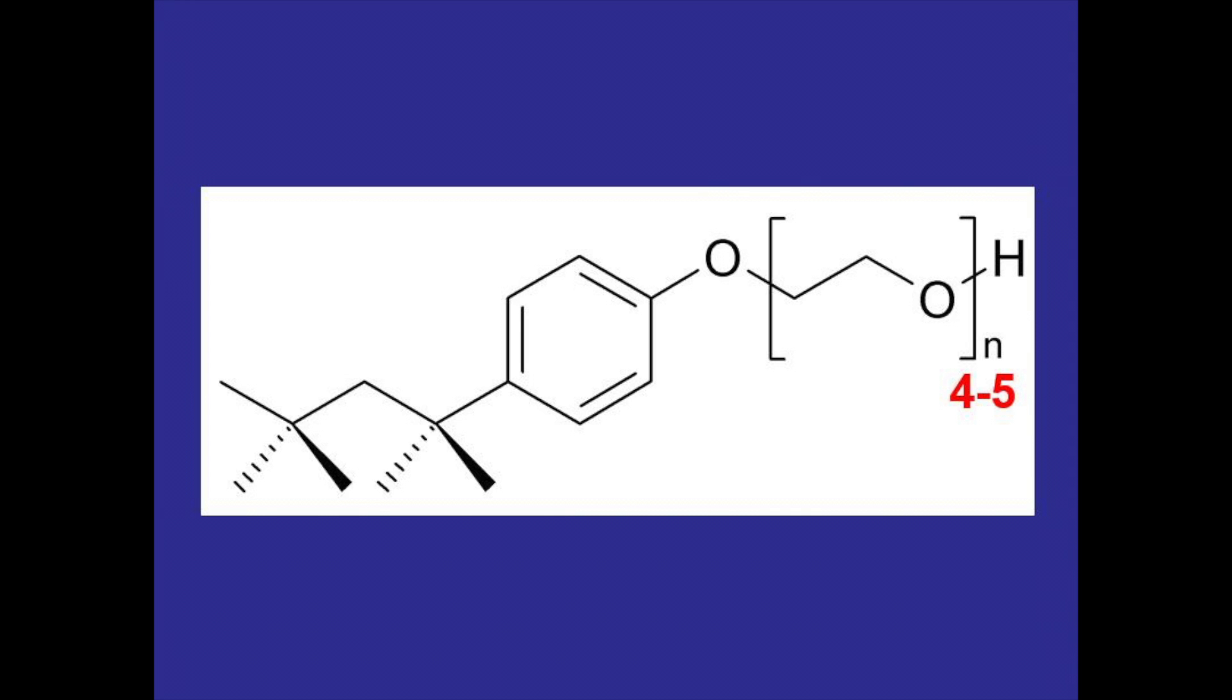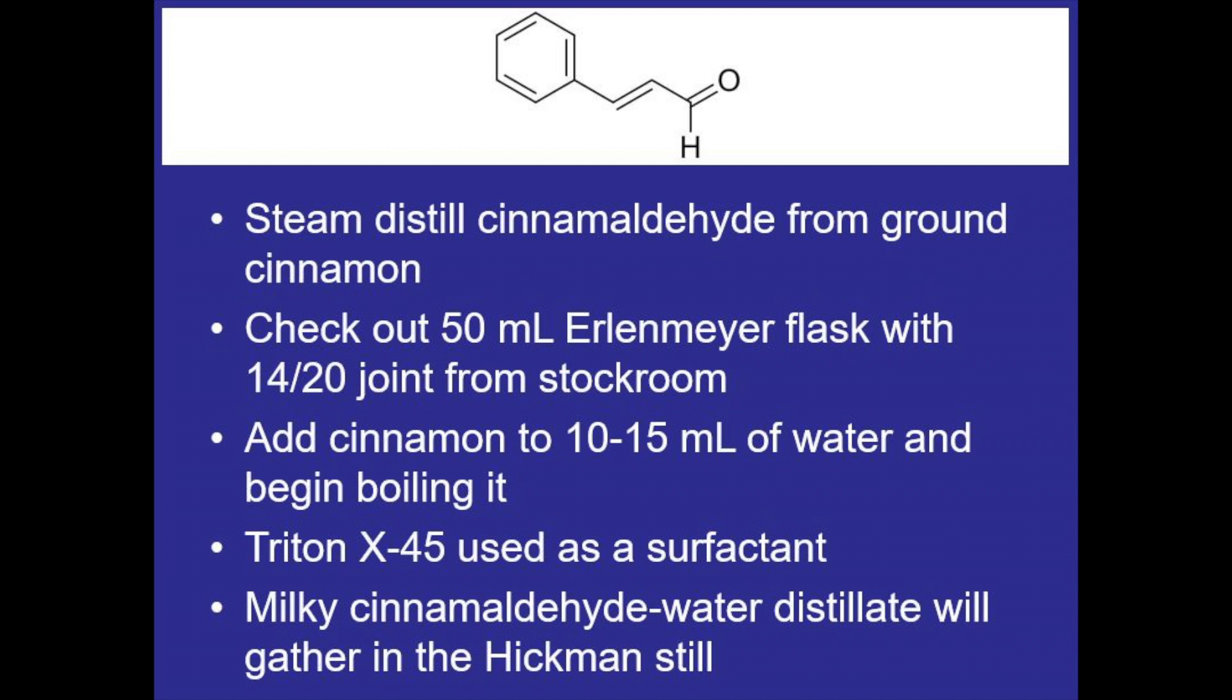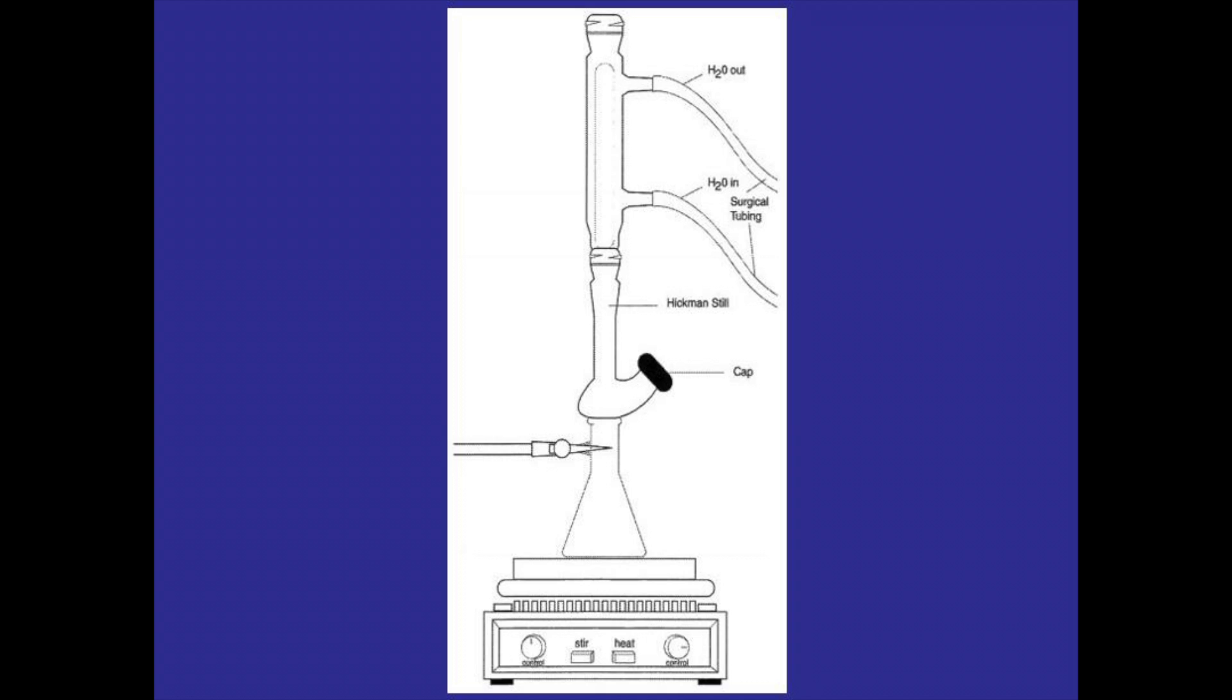As the mixture boils a milky cinnamaldehyde water distillate will start to gather in the Hickman still. The water and cinnamon will be boiling in the Erlenmeyer flask and the distillate will start to rise, condensing and gathering in the base of the Hickman still, and then we can remove it from there using a Pasteur pipette. We'll gather about five to seven milliliters of that distillate into a separate test tube.